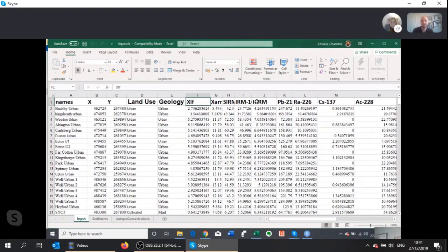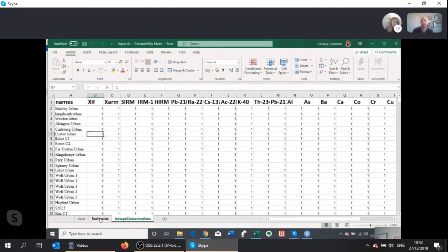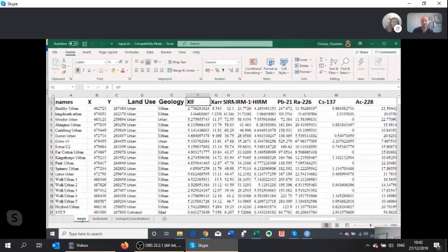Hopefully that should be explanation enough for how to fill that one in. Okay, so I actually just made a mistake. I was working for a time on setting this up so you could use isotopes in the mixing model, where you get something called concentration dependency.